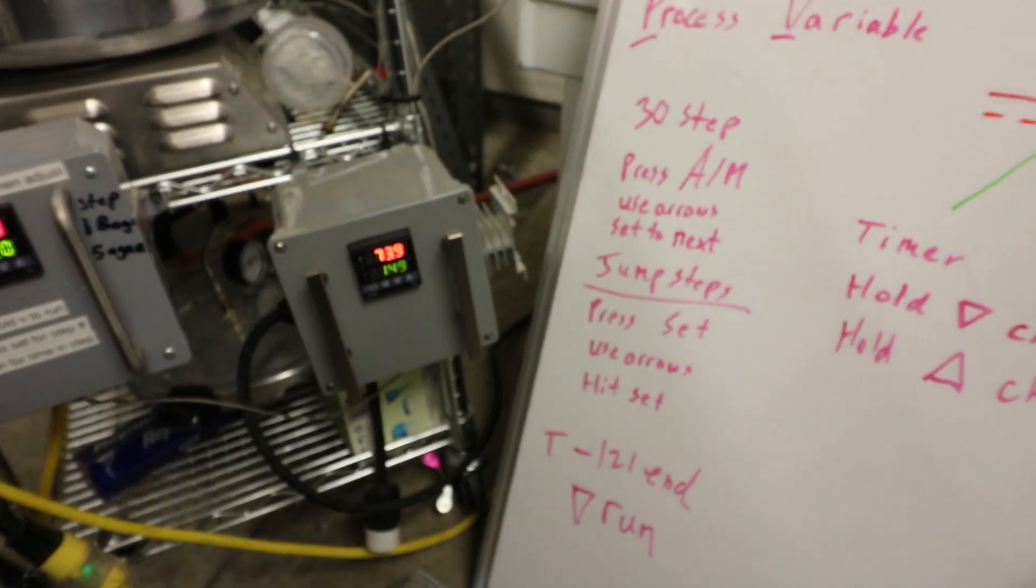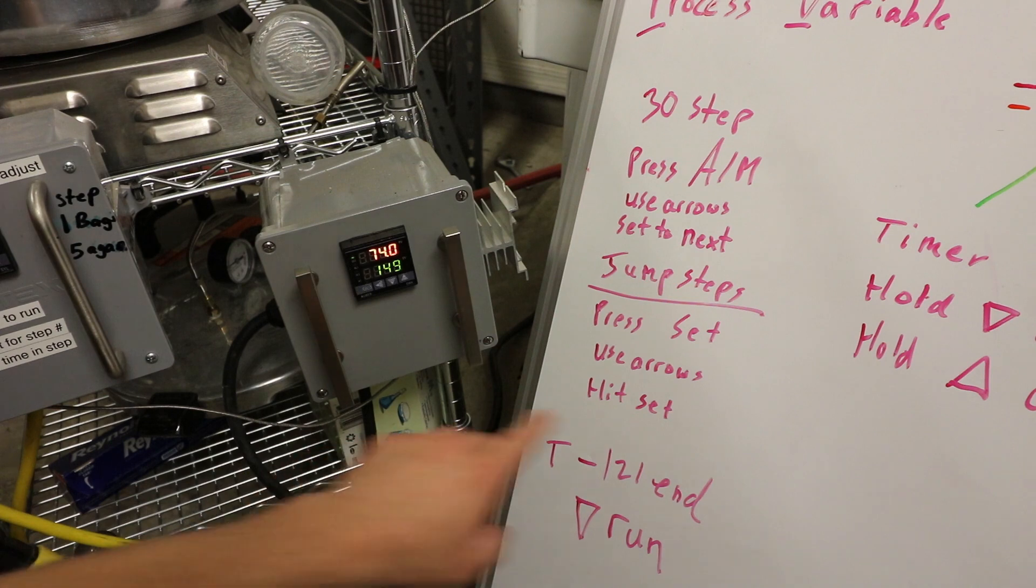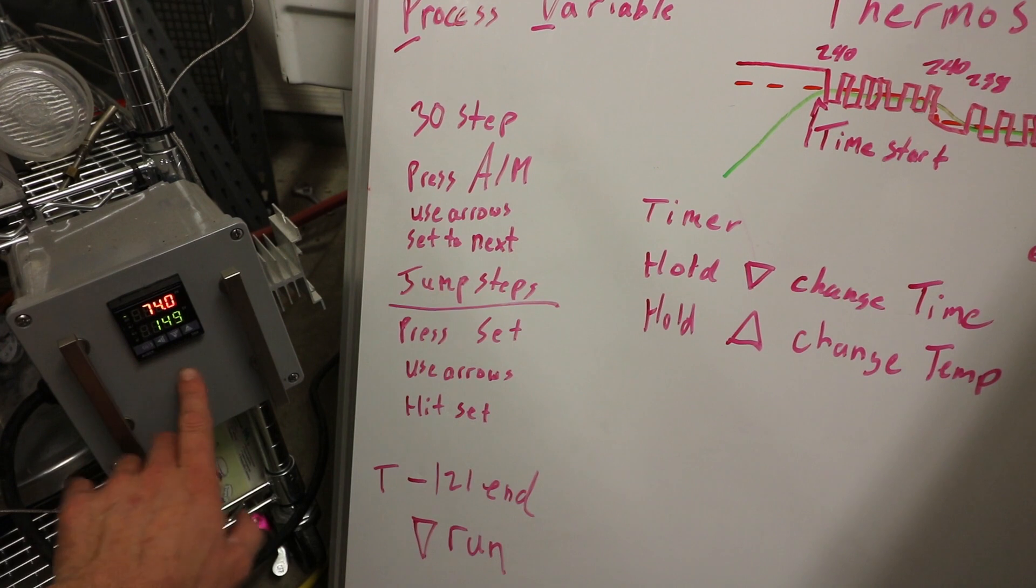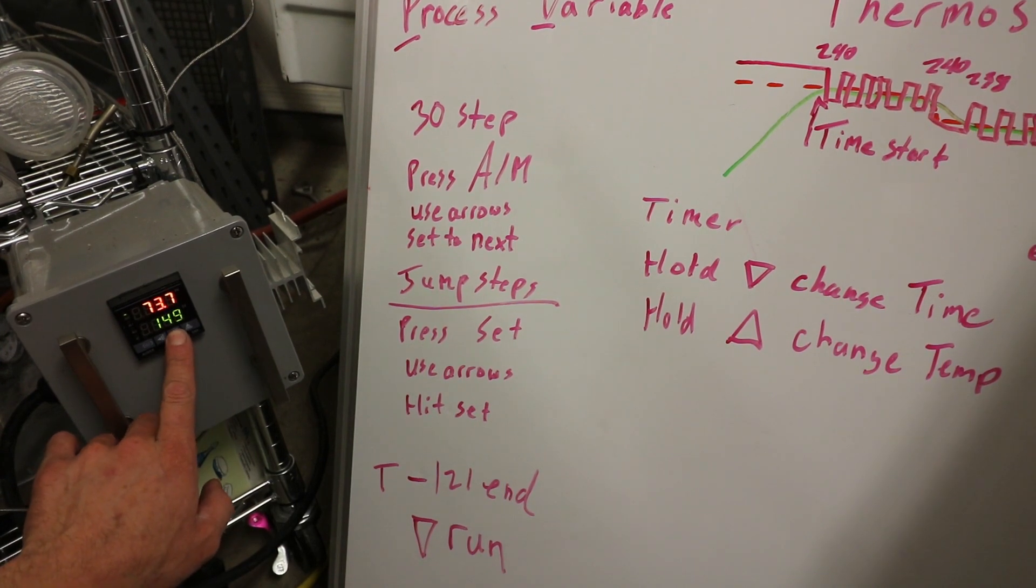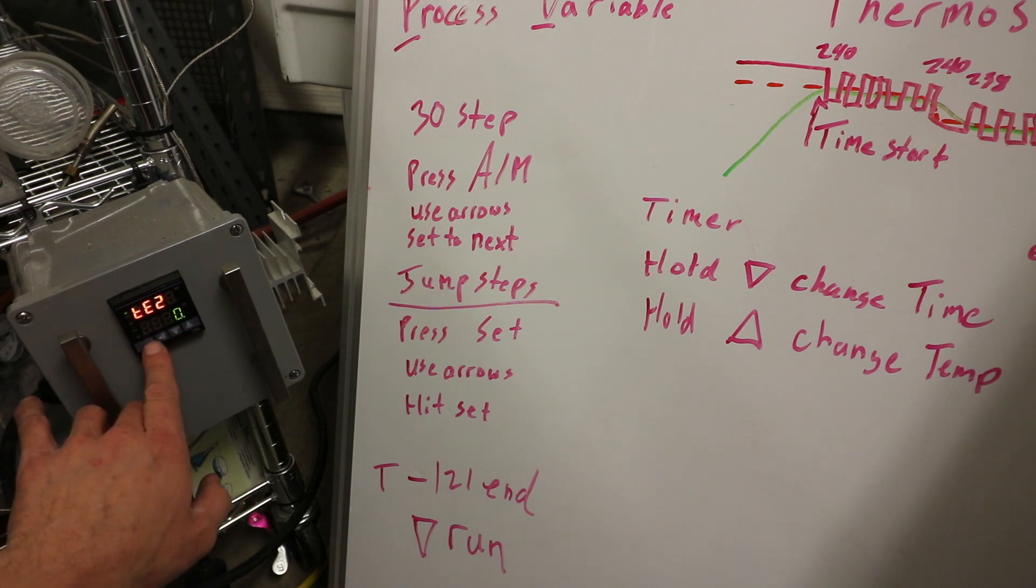So if you want to adjust the time, the timer says hold down to change time. So all you do is you press the down button. If I wanted to adjust that, move the decimal over. That's how you adjust the time.